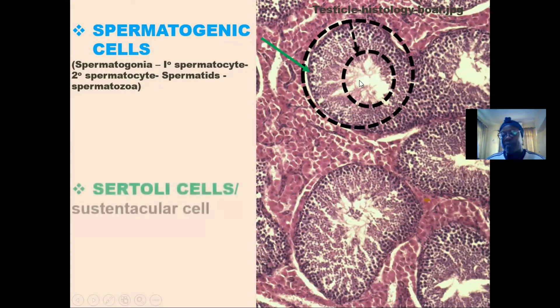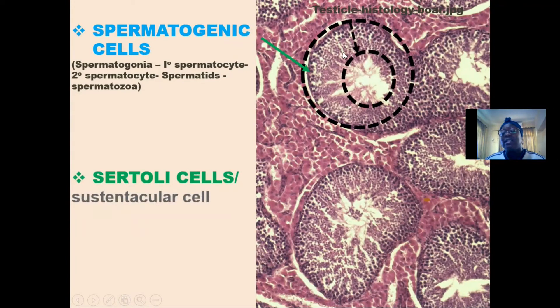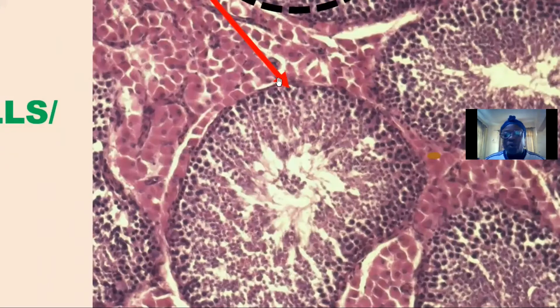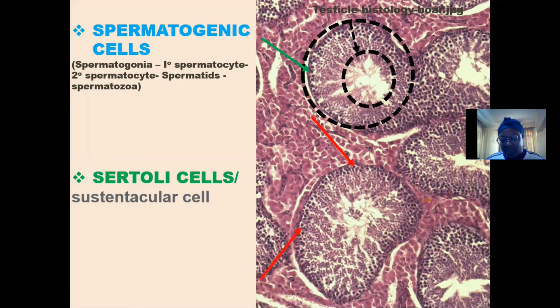The second type of cell is the Sertoli cell. They are the supporting cells and are located within the spermatogenic cells. They tend to give structural support to the spermatogenic cells and also help to provide nutrients and nourishment for the developing spermatogenic cells. Here is the Sertoli cell — you can see it embedded within the spermatogenic cells. This is another Sertoli cell in this region of the seminiferous tubule.